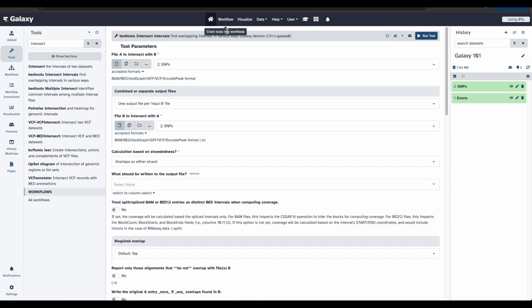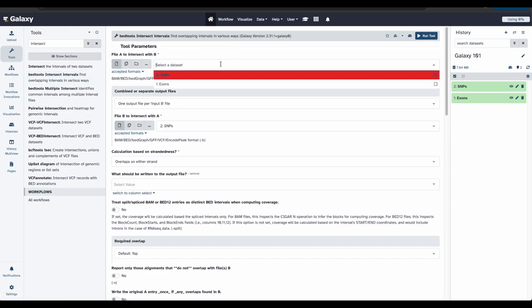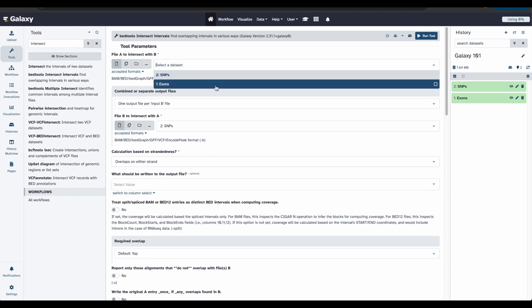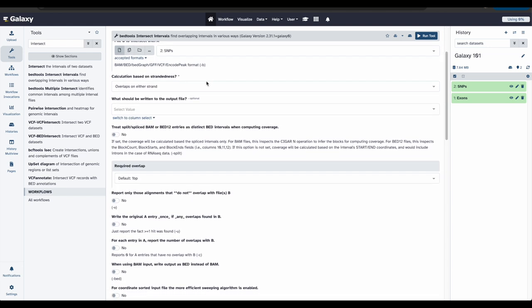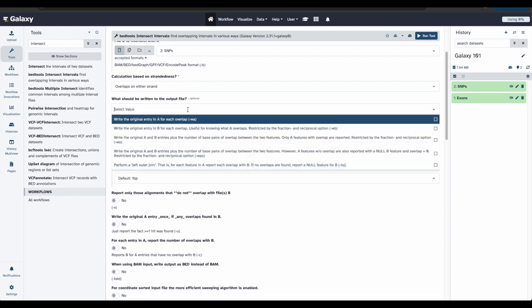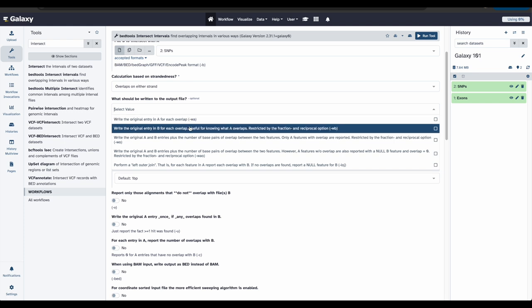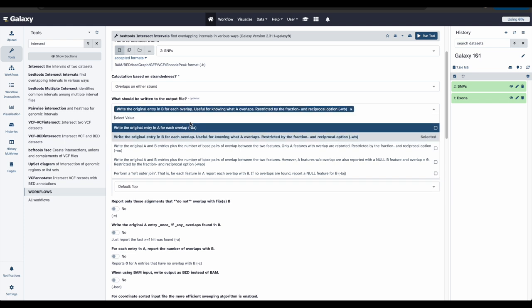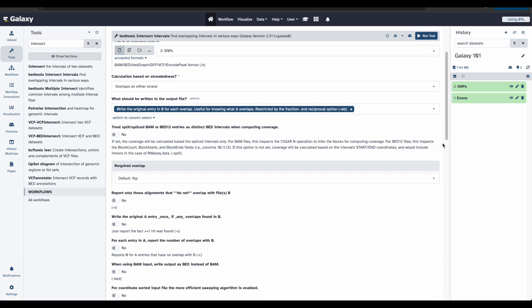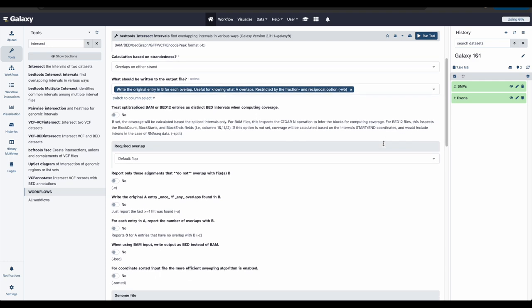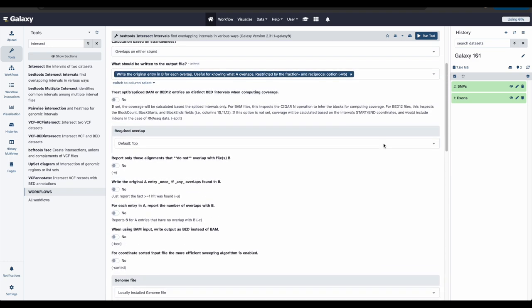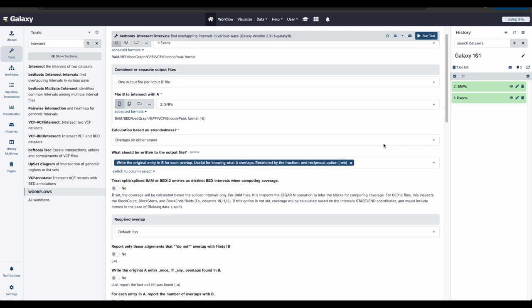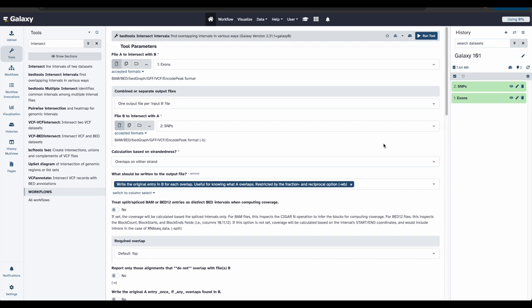Now, we can update the tool parameters to fit our needs. The interface of the tool should look something like this. Once you have it filled out, click run tool.